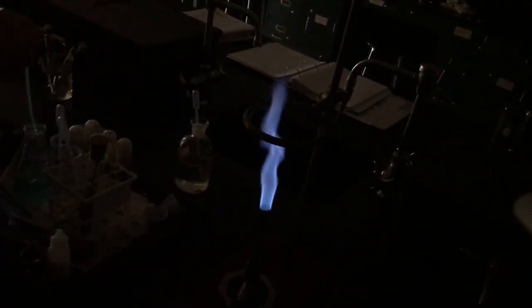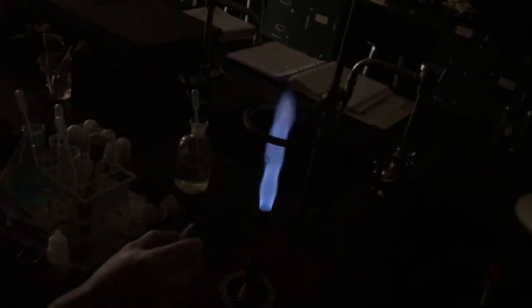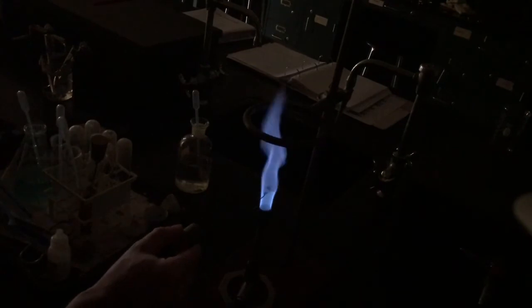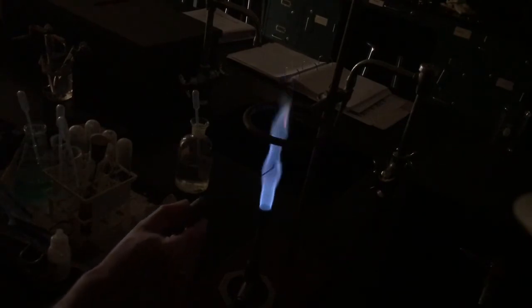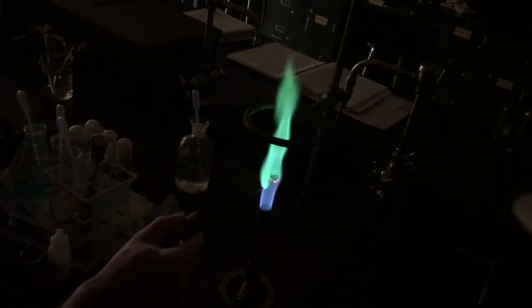So look at what a copper flame will look like. This is going to be copper 2. If it'll go, there we go. So it's going to be green. That's pretty cool.